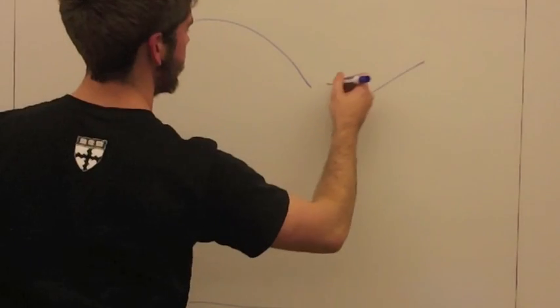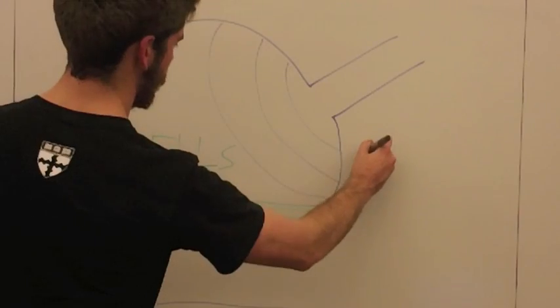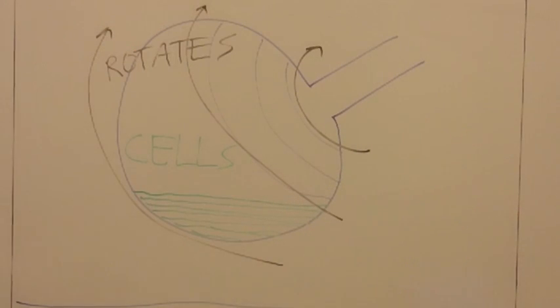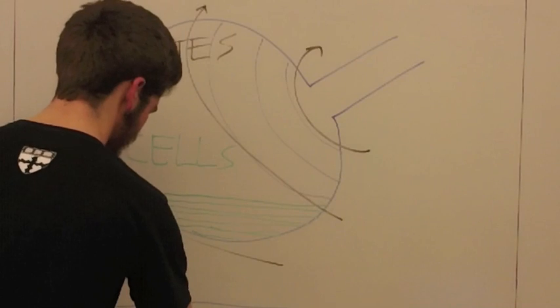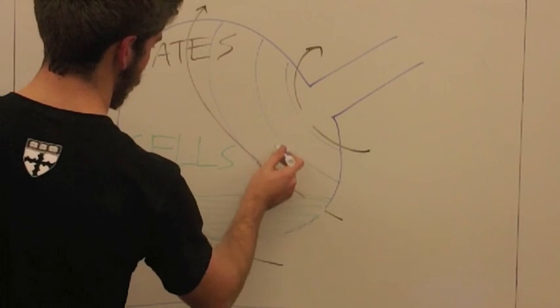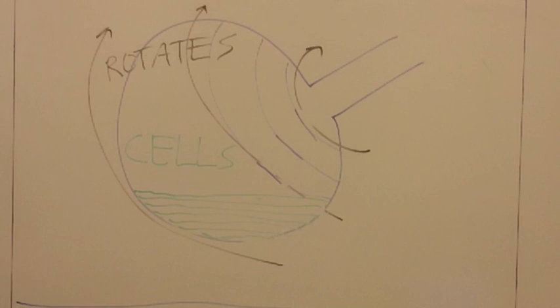My next thought was to rotate the container instead of moving the cells on a belt. I decided to use a glass sphere, or orb, and place the cells and media at the bottom. Then, by slowly rotating the sphere, new area would be exposed coming down one side, and dead cells still adhered to the bottom would be pulled up the other side. This achieved the same purpose as the conveyor belt, but removed the mechanical complexity and solved the problem of having actuators inside the media.